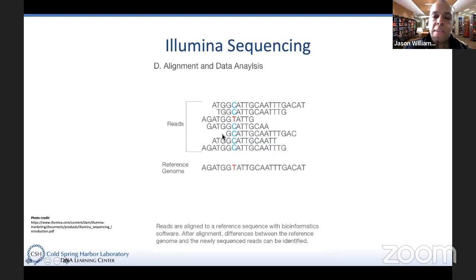And you need to look at all of those reads. Sometimes you might have an error like this T. That's probably a mistake since we only have one read showing up with a T. But in some cases, maybe you have half the reads with C and half the reads with A. That may mean you have a spontaneous mutation, maybe unlikely, or if you're comparing different samples, then of course there could be biological variation. It could be sequencing error, or it could be that the individual is heterozygous for that particular locus. There's lots of confounding factors, and that's what the bioinformatics is about: separating out all those differences and finding the real difference that's interesting versus lots of biological differences or other forms of noise.